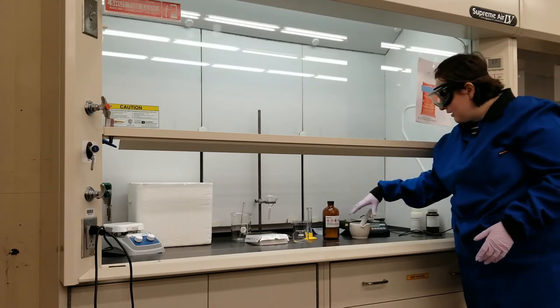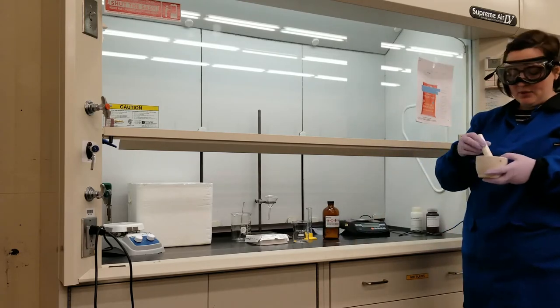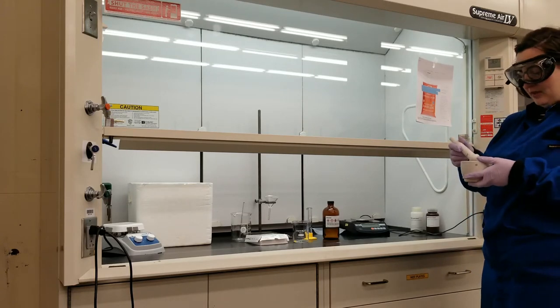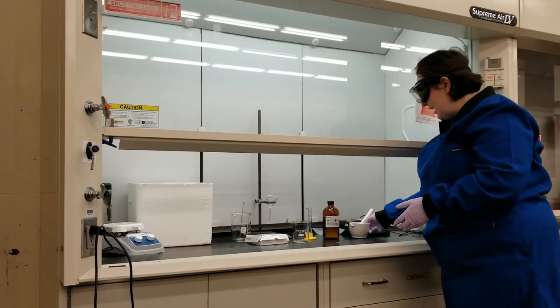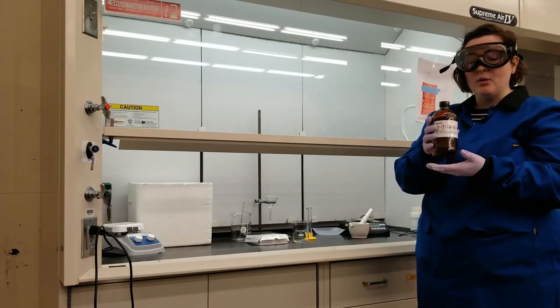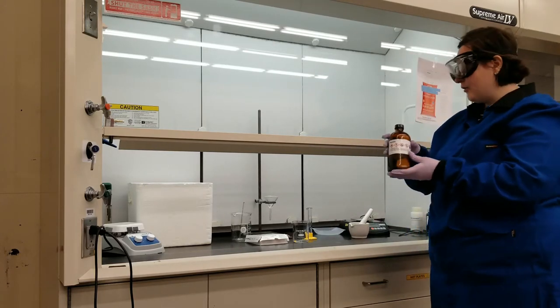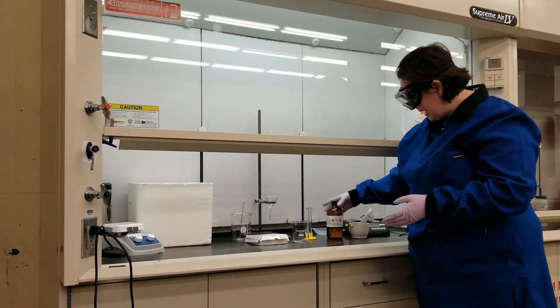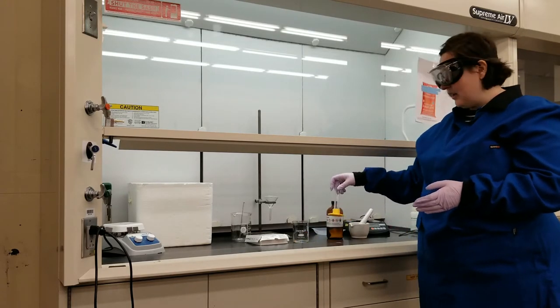I'm going to want to increase the surface area of my chips so that they can interact with my non-polar solvent, so I'm going to use a mortar and pestle, and then I'm going to want a non-polar solvent to extract the fats from the potato chips, so I'm using hexane today, and I'm going to be able to measure it in a graduated cylinder.